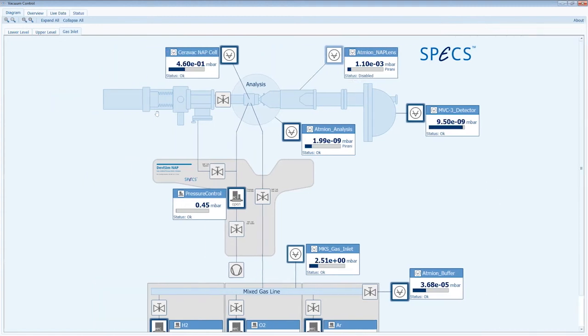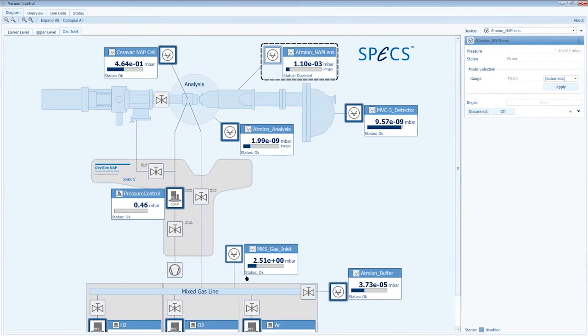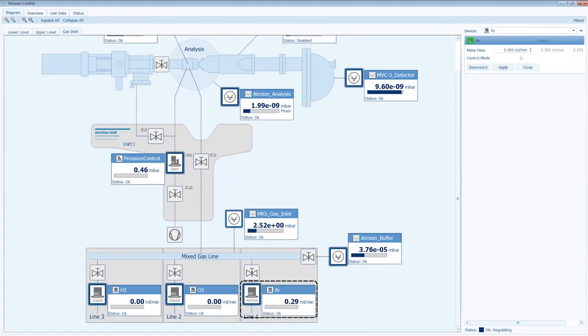Normally we change those by ourselves. However, for this kind of operation, you need to open the analysis chamber or let the atmosphere in. Based on experience, we can even operate without this vacuum gauge, so we just keep it until we have time to change it.